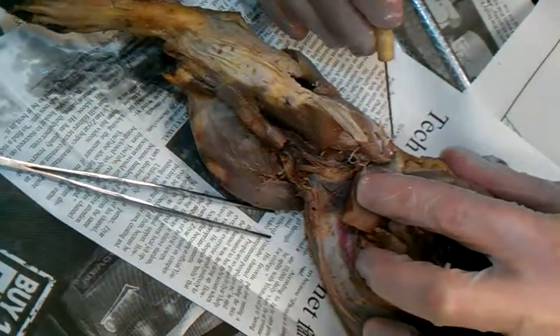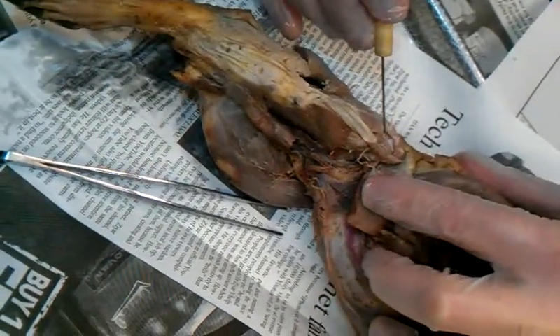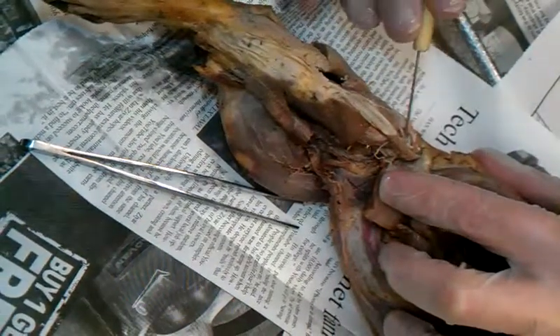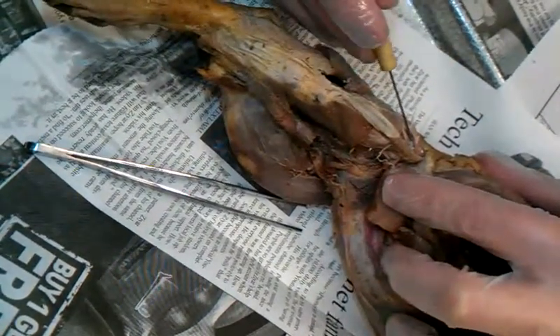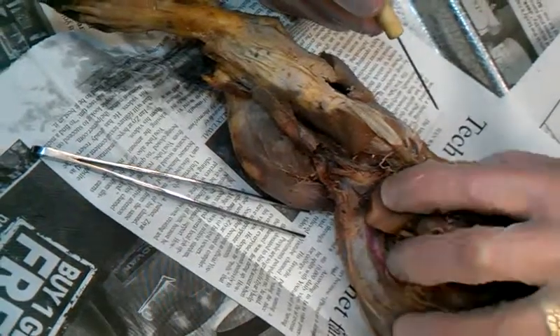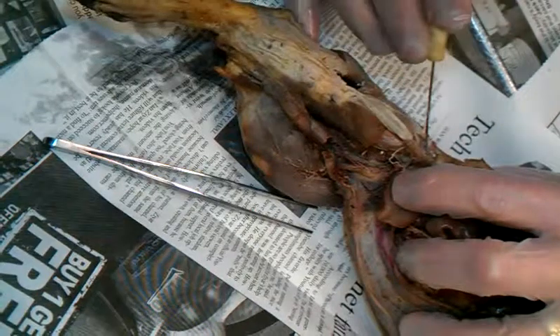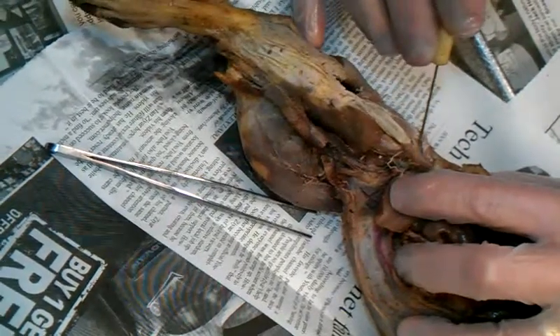So there's the gluteus maximus, and the smallest one I just separated is the profundus. We call it the gluteus minimus in humans, but on the mink it's called the gluteus profundus, and there is the gluteus medius inside there.